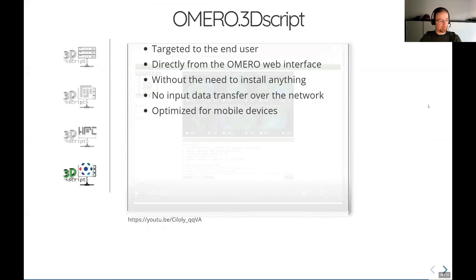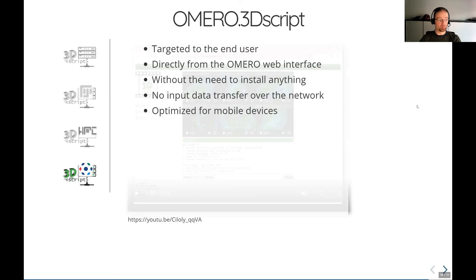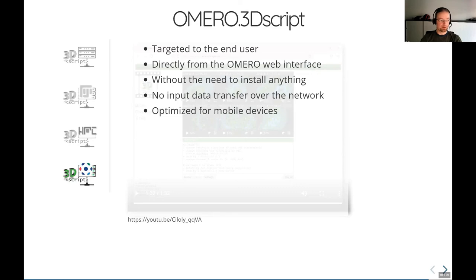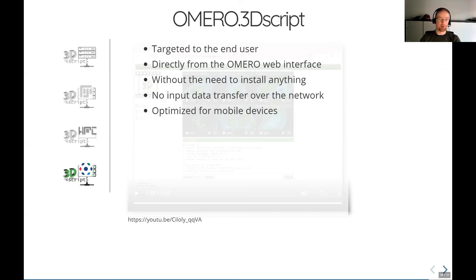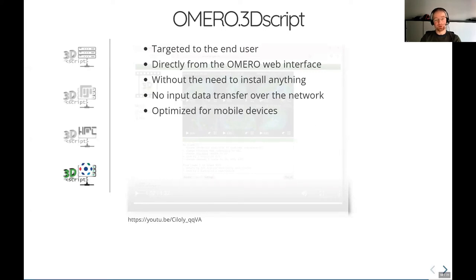So as I said, I think Omero 3D script is the client which is mostly targeted to the end user. It's directly accessible from the Omero web interface, which means there's no need to install anything, at least not if you're the end user. Of course, you need to install it if you're the Omero administrator. There's another advantage, which means there's no transfer of input data over the network because this runs directly where the Omero server runs. And something that I haven't mentioned is the Omero web interface and the 3D script Omero web interface is also optimized for mobile devices. So you could now create your 3D animations directly from your mobile phone if you wish. And there actually, there's another benefit of having natural English language because entering text in mobile phones can be cumbersome. But here you could even use the voice recognition because it's just English text. So I don't think there's an easier way to create 3D animations right now.